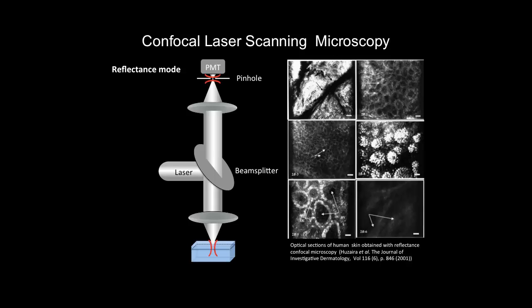Does that mean that the lens that you use to focus the incident light into the sample is identical, perhaps, to the lens that focuses the light into the hole? Yes, that distance is conserved. So to look at deeper depths, do you translate the tissue up and down, or do you move that lens?